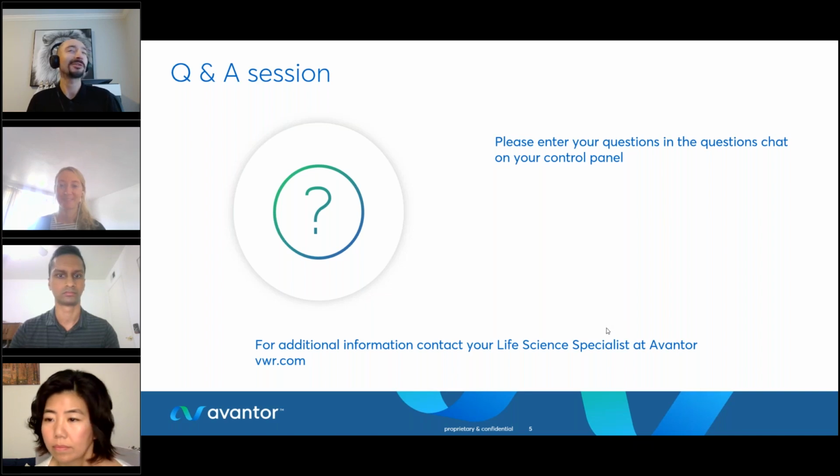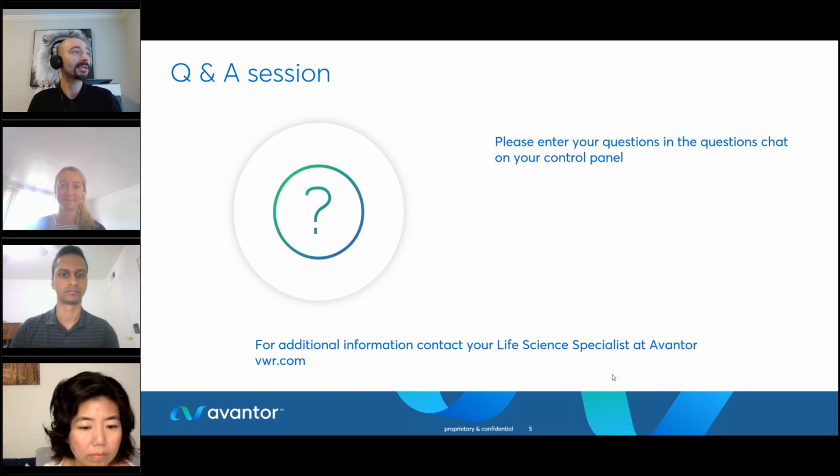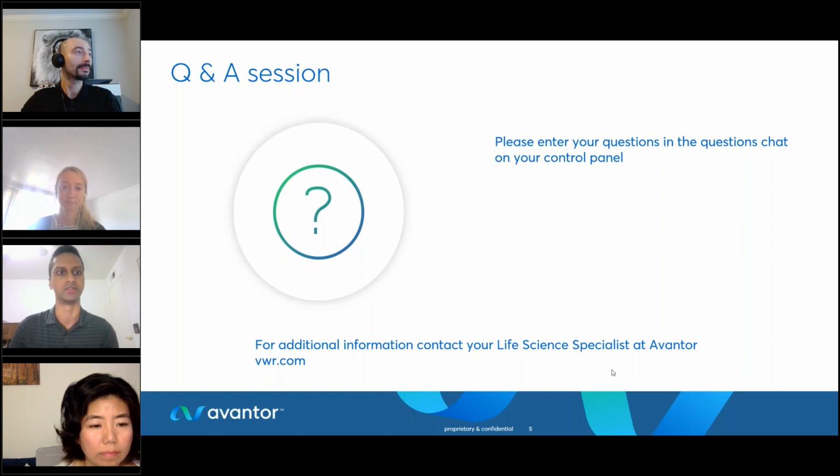Thank you. Aaron, this next one's for you. When the barcodes are added, is the plasmid converted to a linear molecule? Yeah, so the transposase molecule will simultaneously add the barcodes and linearize any of the circular plasmids that are in the library, making it suitable for attaching the rapid adapters for sequencing.